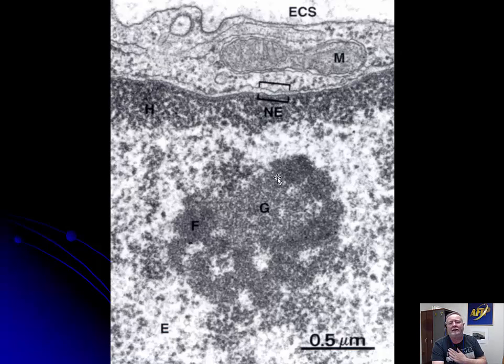Okay, nucleoli. Most cell nuclei have nucleoli. There are two parts to the nucleoli if you want to get deep into it. You have the granular or lucent areas of nucleoli, and you have the fibrillar part. I just don't use that very much. I just say that the nucleoli are here or they're not.